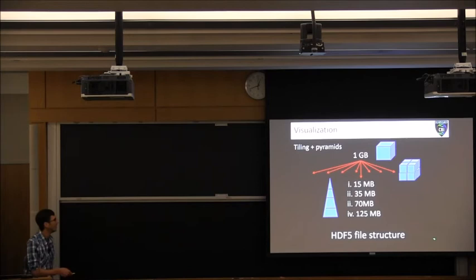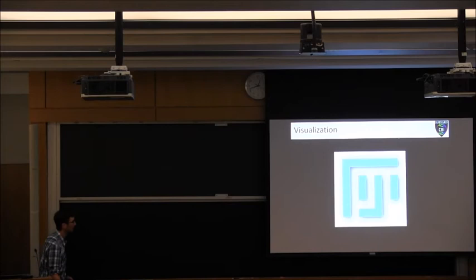Okay. And this is a really simplified explanation of what's called the HDF5 file structure. This is an open source file structure, but even all of the closed source ones really run something similar to this type of format. Great. So that's kind of what's often going on in the background.